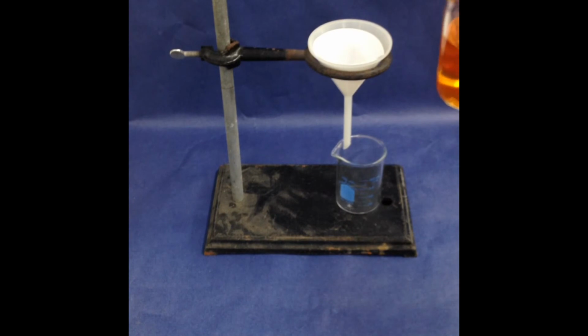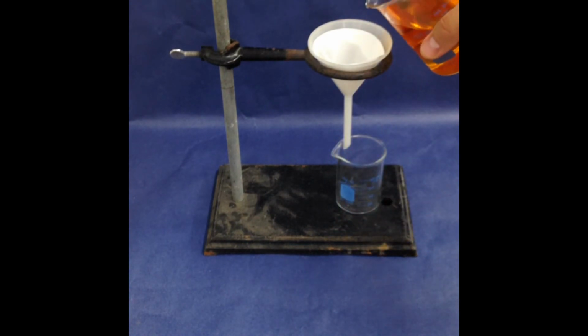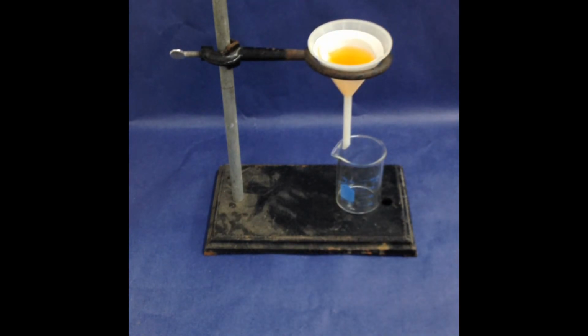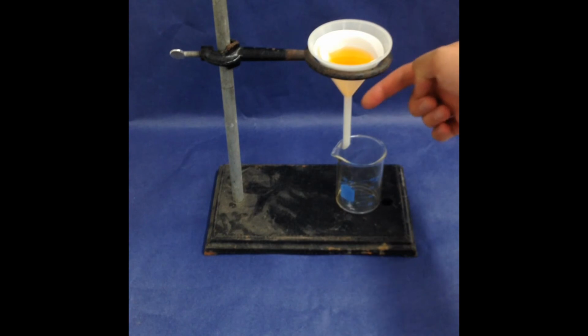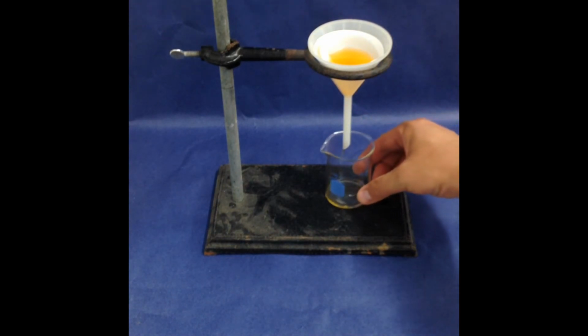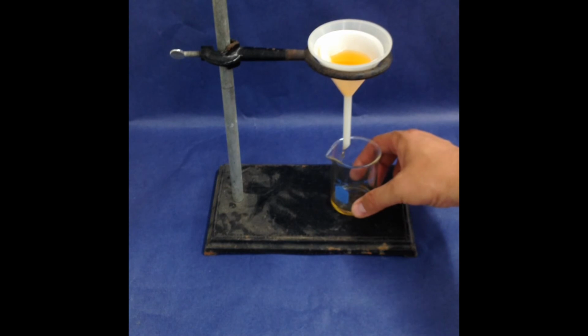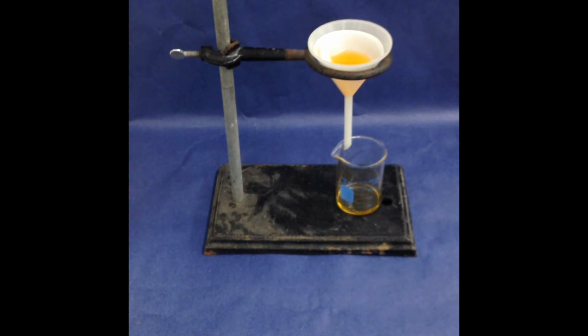So let's say that I have a liquid, and I'm going to pour this liquid into my funnel. And just to show you what I mean by this, all right, so I pour some liquid through, and you can see that the liquid is actually moving down the side of the beaker. All right, if I move it away, you can see that it starts to drip into the beaker freely like so, but this may cause splashing. So you really want the edge of the beaker to touch the stem of the funnel and allow a nice stream to flow down the side.